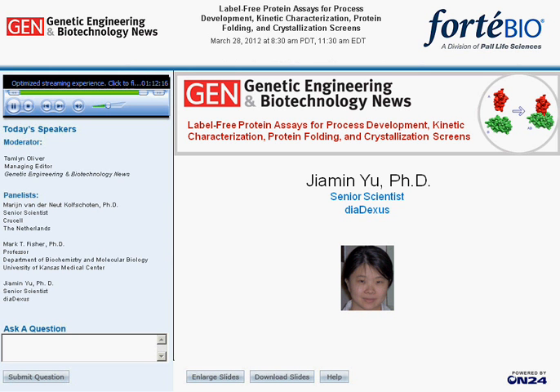Great. I have one final question for you. What do you expect is the net savings using the ForteBio method versus traditional screening, given that the sensors are expensive, and can the sensors be reused?